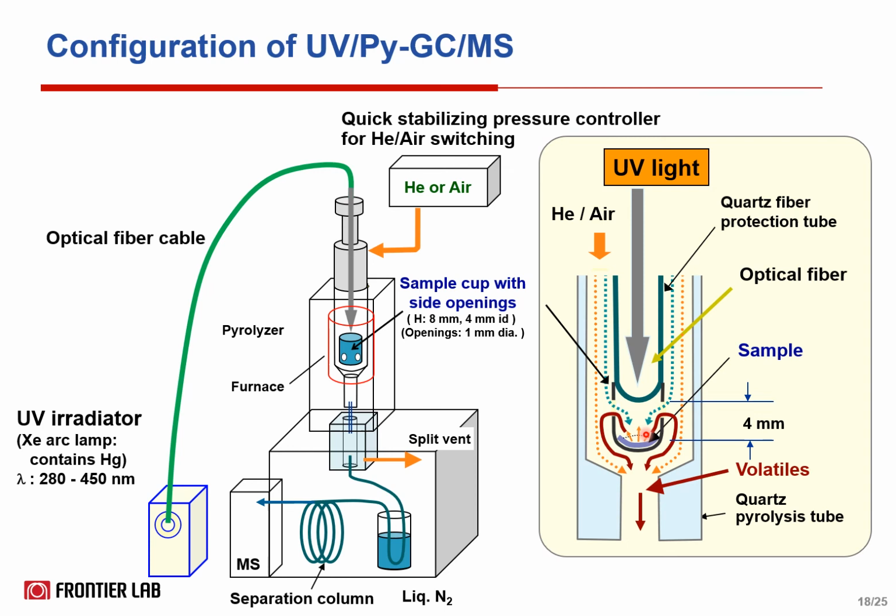Photothermal oxidation-induced volatile degradation products are then cryotrapped by immersing a short length of the column head into a liquid nitrogen. The condensed volatile components are then analyzed by GCMS. In addition, the residual degraded polymer sample in the sample cup can be analyzed by either EGA-MS or Py-GCMS afterwards.